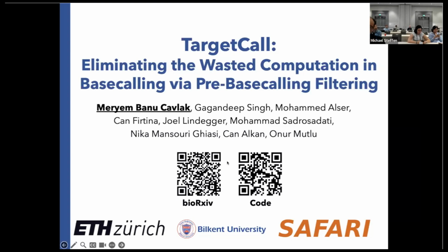Banu, I was wondering if you considered comparing with SquiggleFilter and SquiggleNet. I mean, maybe not quantitatively, but at least qualitatively. Yeah, we actually did that. We couldn't compare against SquiggleNet because this requires us to retrain their networks for all the different use cases we tested. That's why we said they cannot be applied as general purpose pre-base calling filters.